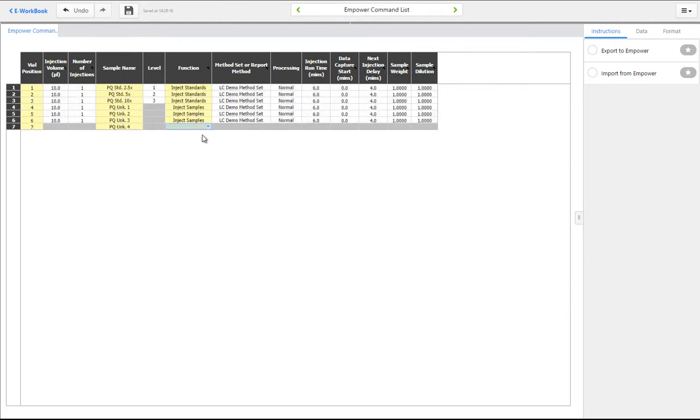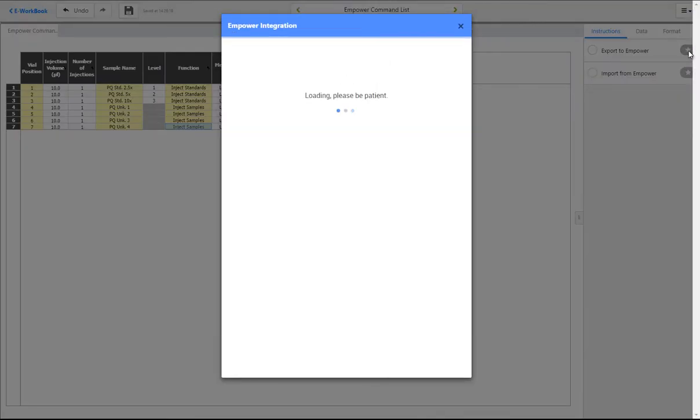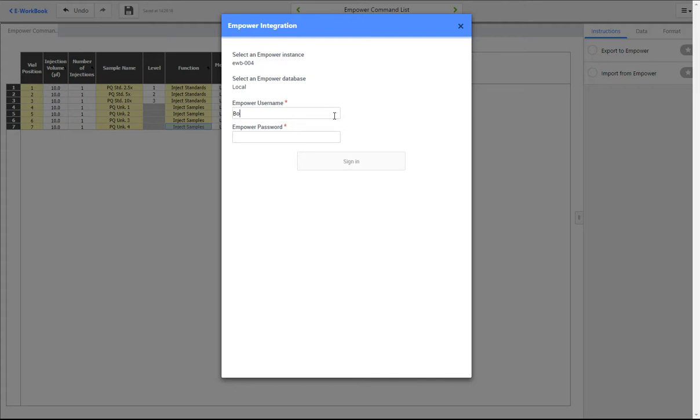Spreadsheet instructions can be used to export this sample information to mPower from directly within your workflow. You will need to sign into mPower and record any additional information about the export to proceed.